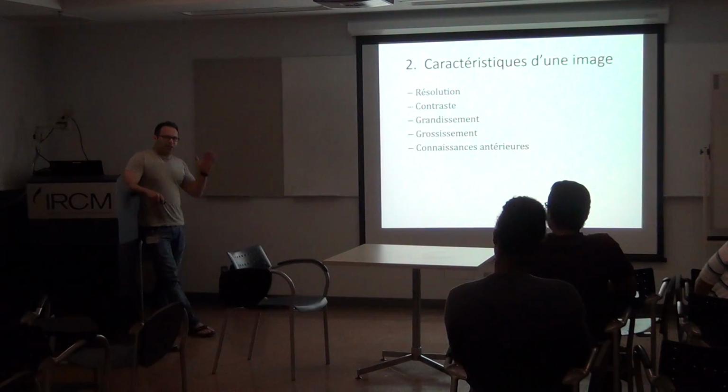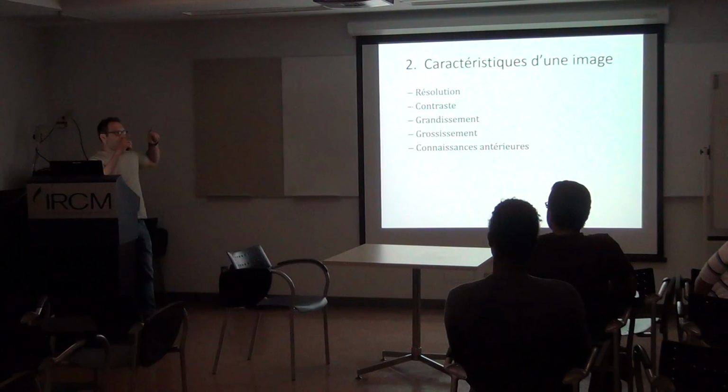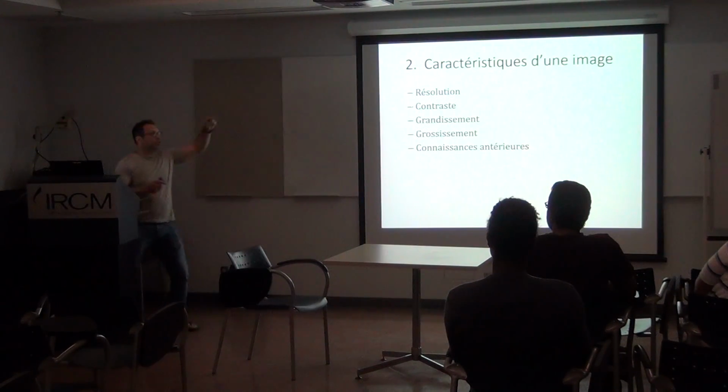In microscopy it's much more defined than in photography, because when you take a picture of something, you will never get the scale unless you put a ruler into your image.